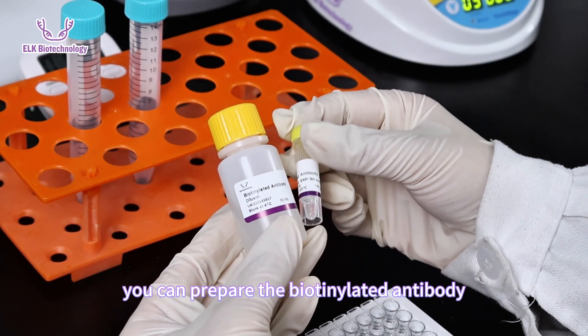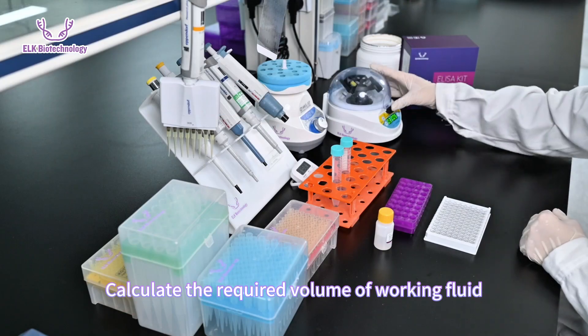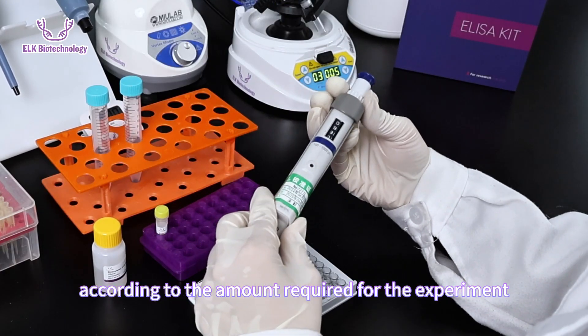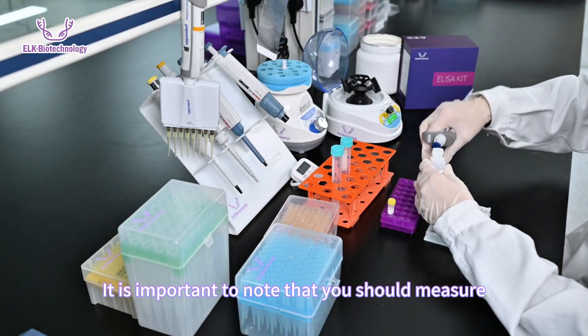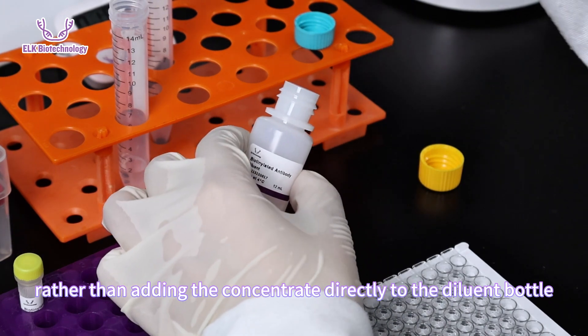During incubation, prepare the biotinylated antibody working solution in advance. Calculate the required volume of working fluid according to the amount needed for the experiment. After measuring the diluent, add the corresponding volume of concentrate. Note: you should measure the concentrate rather than adding it directly to the diluent bottle.